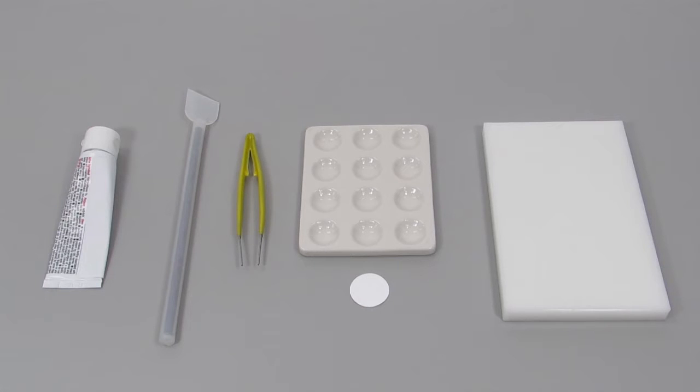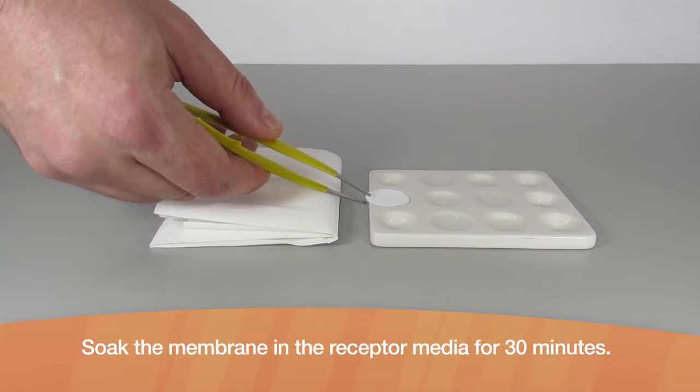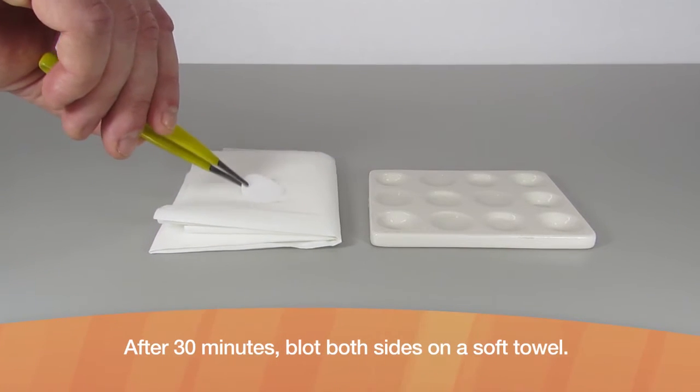Spot plate, membrane block. Soak the membrane in the receptor media for 30 minutes. After 30 minutes, blot both sides on a soft towel.